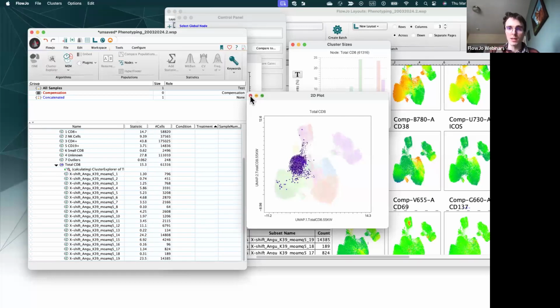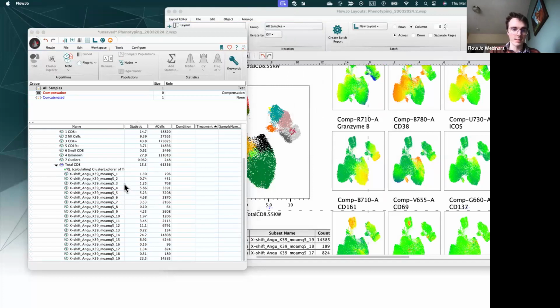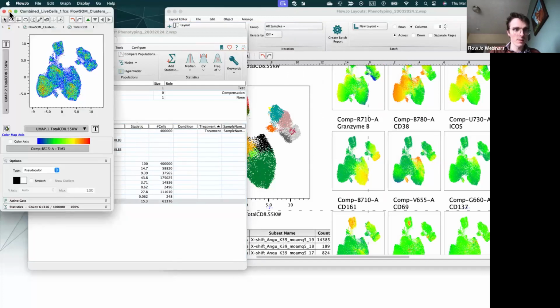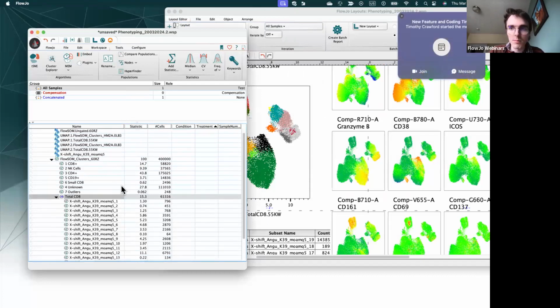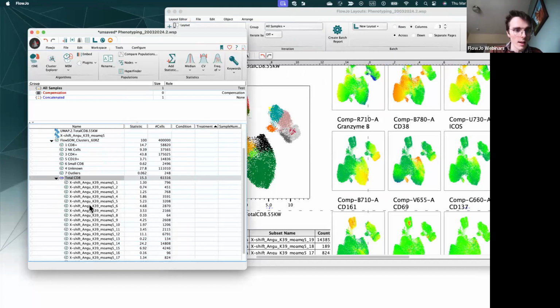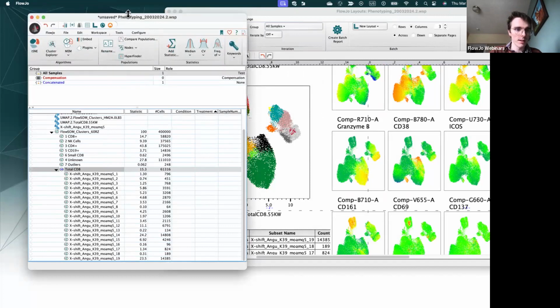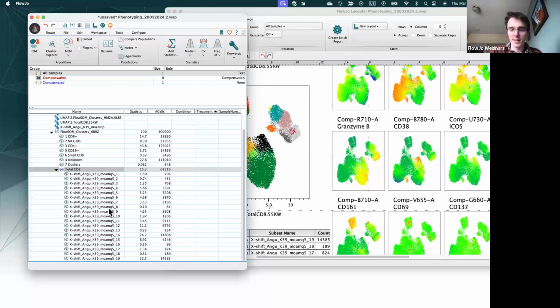I think they might be including the data as well, so hopefully you can get access to both of those things. All right, let's go ahead and close Cluster Explorer just so we can get that gamma delta population that I merged. Should have made it, but I don't. Oops. Don't see it. Maybe I didn't press the button, right? Okay, let's just carry on. I don't know where that population went.